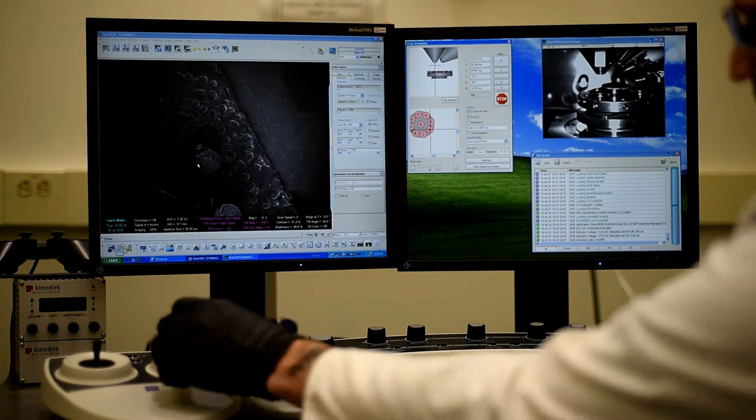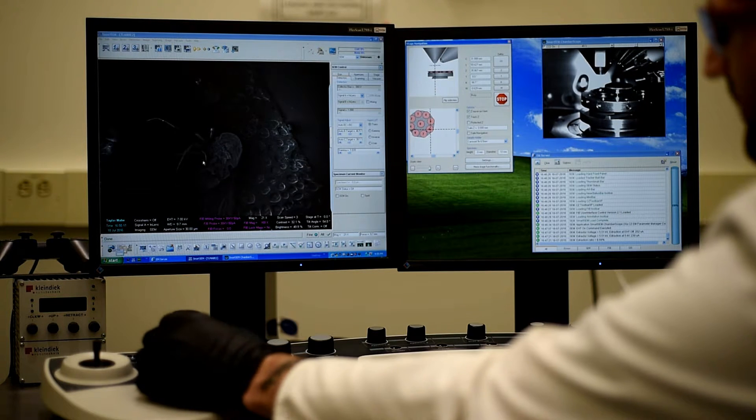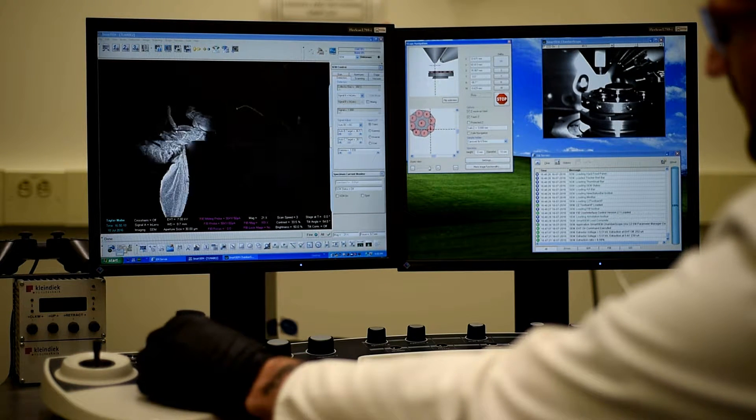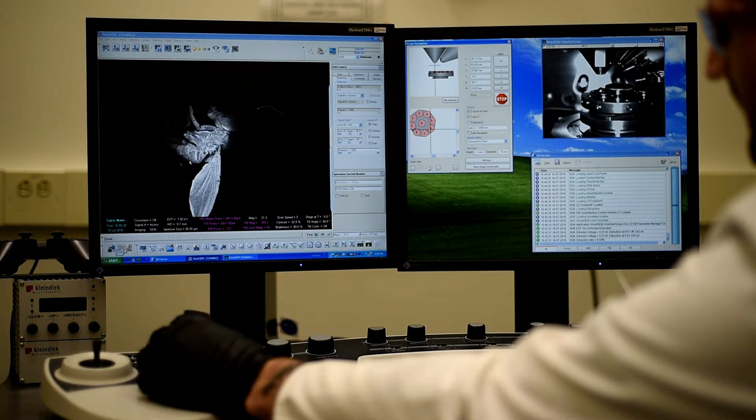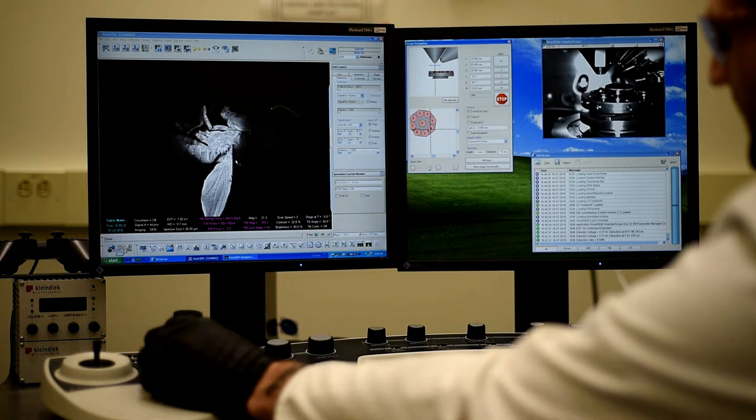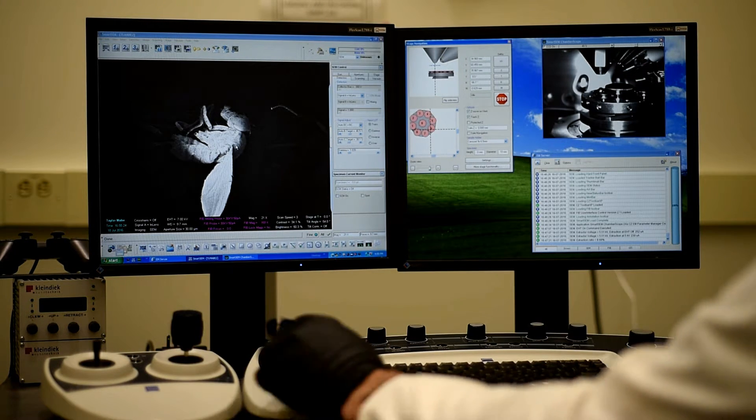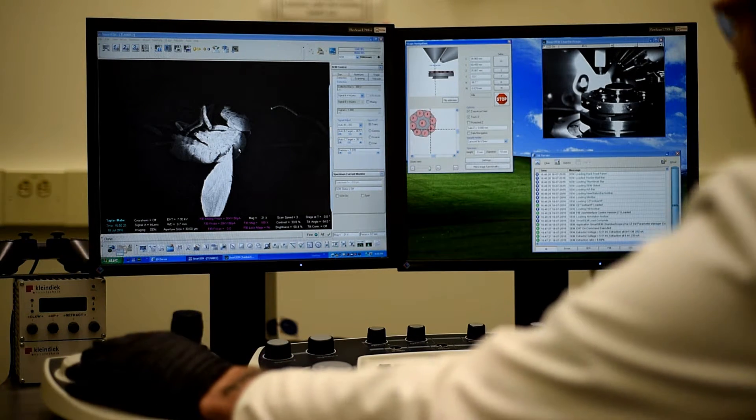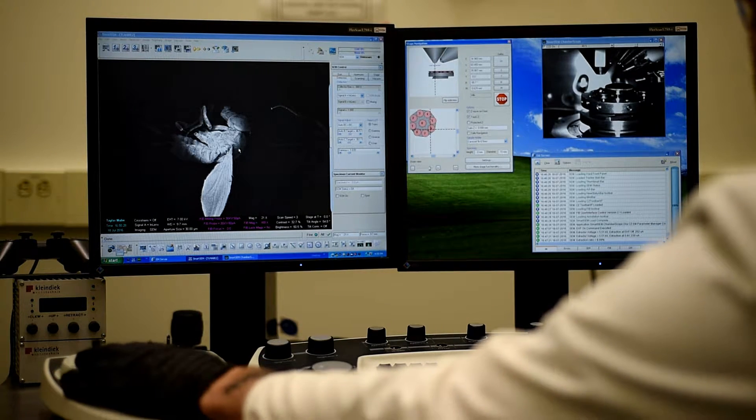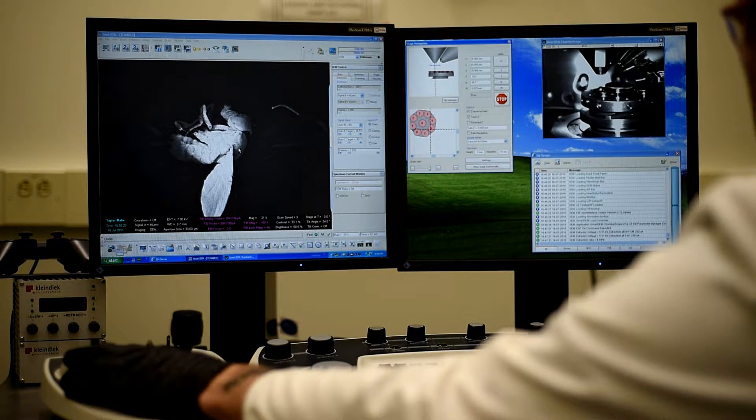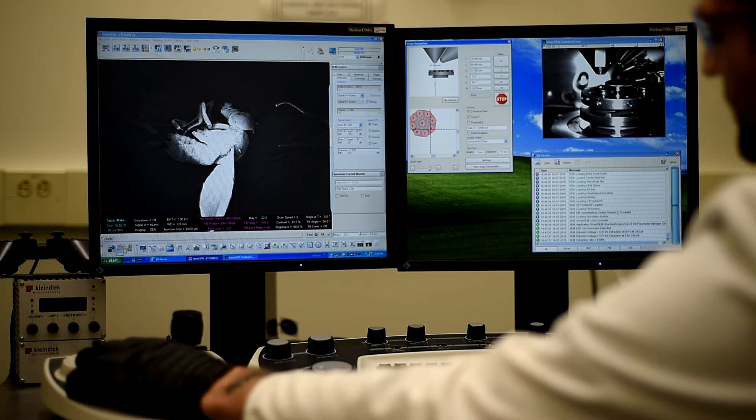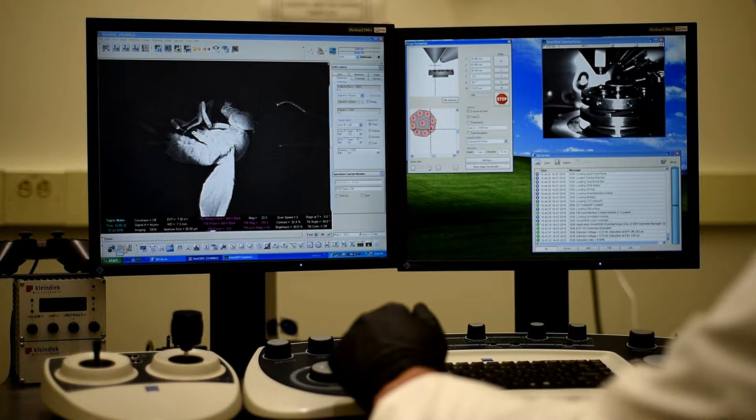So again, the X and Y is controlled with this joystick. So I'll move up and across. And there we can see one of our guys that's been sputter-coated. And now we can move up. If we wanted to have finer resolution, we would decrease the working distance by moving it closer.